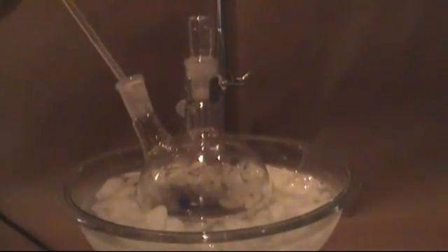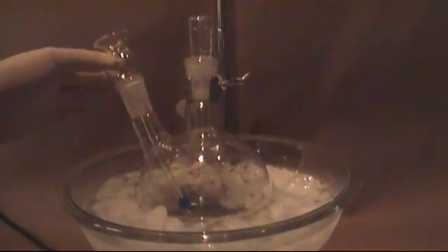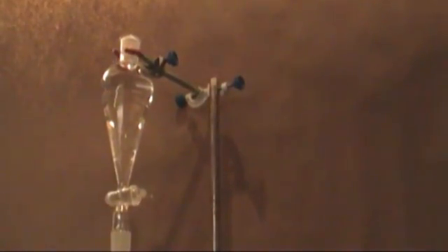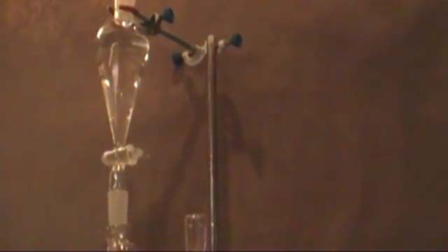Now on the side neck of the flask, add a thistle funnel if you have one. It is not imperative that you use one — it just keeps the ethanol from sitting on top of the sulfuric acid. Now attach an addition funnel to your stand just above the thistle funnel. Pour into it 200 milliliters of ethanol — I am using Everclear. Begin to slowly add the ethanol drop by drop into the thistle funnel. The ethanol needs to be added so that the ethanol and acid mixture does not heat up. For me, the entire addition took about 20 minutes.